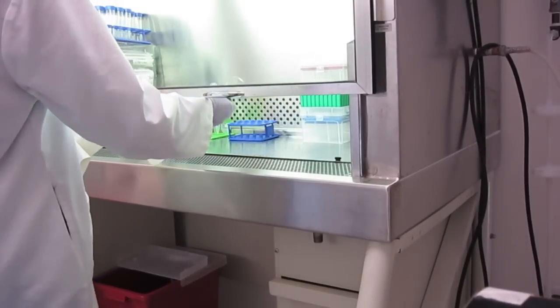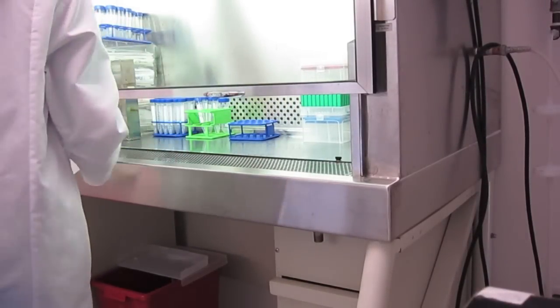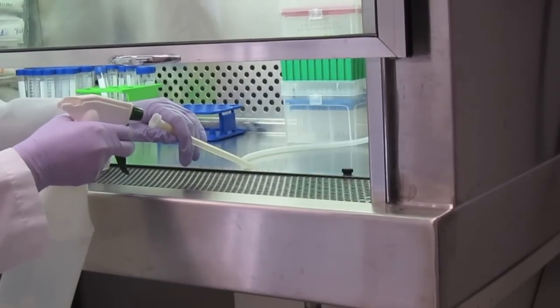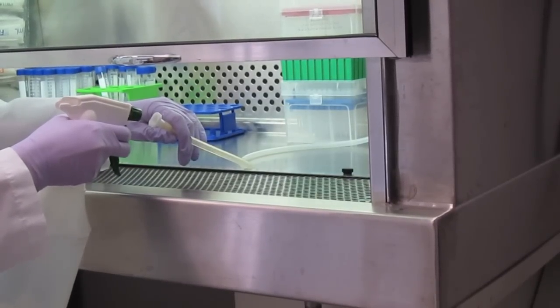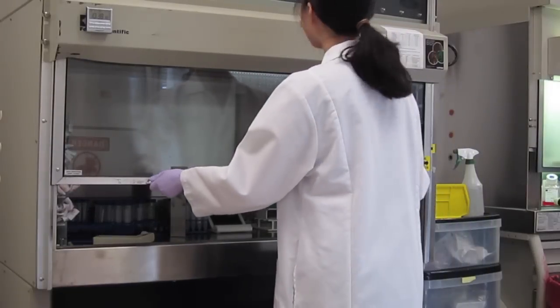When you are finished with your work in the BSC, spray down all surfaces with 70% ethanol. Spray down the vacuum lining with ethanol as well and straighten out prior to turning off the vacuum. Turn off the lights, blower, and close the glass panel.